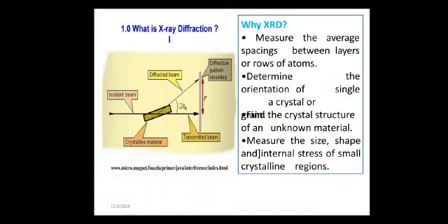So now the uses or advantages of this X-ray diffraction. It is phase identification, so a larger variety of bulk and thin samples can be identified or determined.